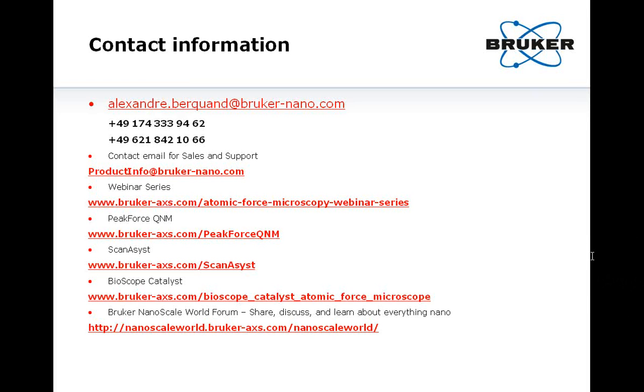Okay, the first question I see is: are any other models, such as Sneddon's model, available to calculate the modulus? That's a very good question. Actually, so far we only have the DMT fit to calculate the Young's modulus, because originally PeakForce Tapping or PeakForce QNM were not developed to work on biological samples, but more on a wider range of samples, including polymers and stiff samples.